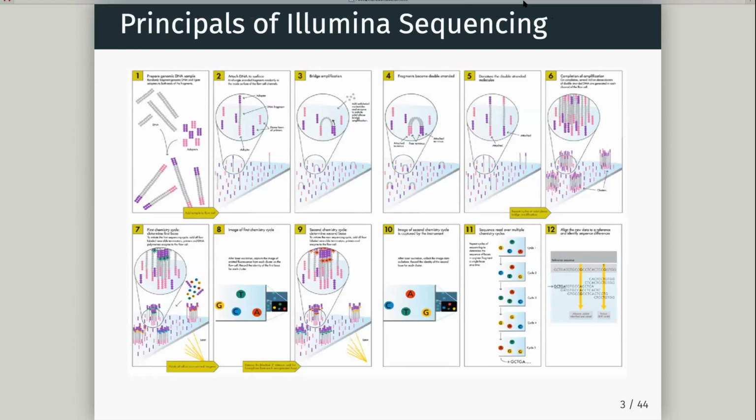So really what we do is we start with our fragmented DNA, in this case, double-stranded DNA. We'll add adapters to this, right? So adapters which allow us to do Illumina sequencing. This then gets made into single strand, and the Illumina flow cell, which is this object we see here. It's sticky and it's got primers or complementary bases here, which will then allow these DNA fragments to become attached to this flow cell. So this is the flow cell surface here. So we've got our double-stranded DNA, we add some adapters, and it's these adapters which allow the DNA then to stick to the flow cell.